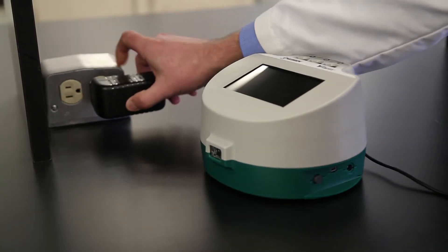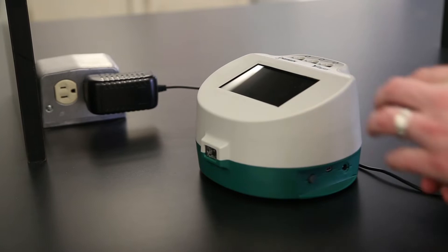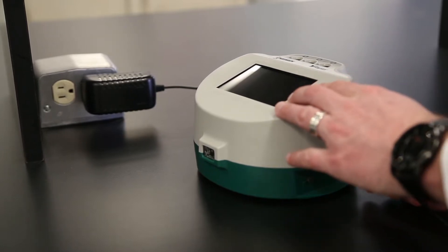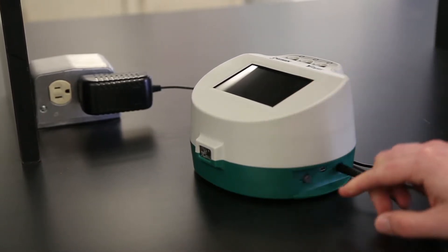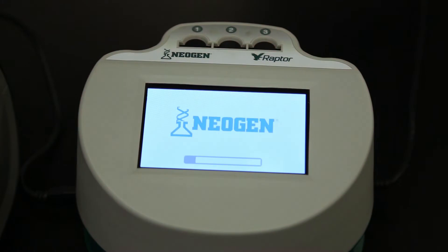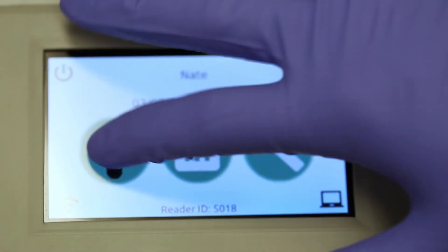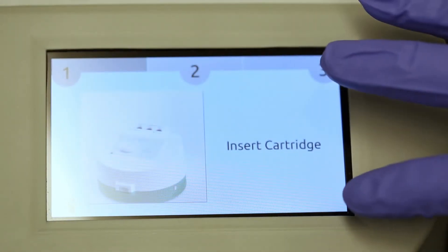To power the unit on, plug the power supply into an outlet, then into the power input. Every time the Raptor is powered on, it performs a self-check analyzing the camera and LED. If for any reason there is an issue, it will be reported on screen. You can use the capacitive touchscreen with or without gloves.